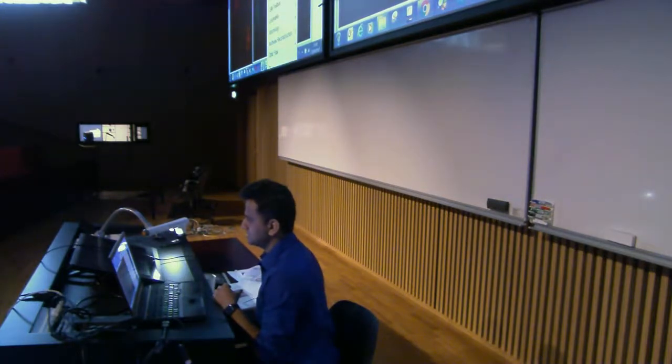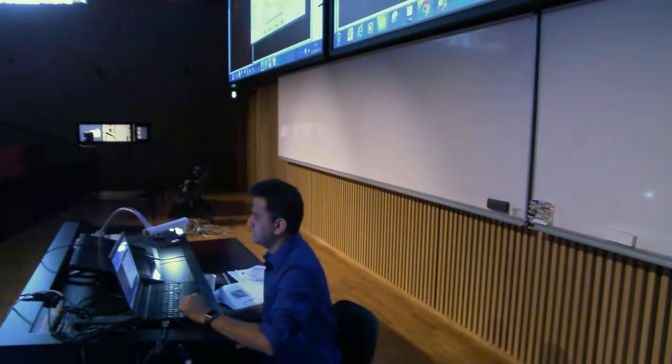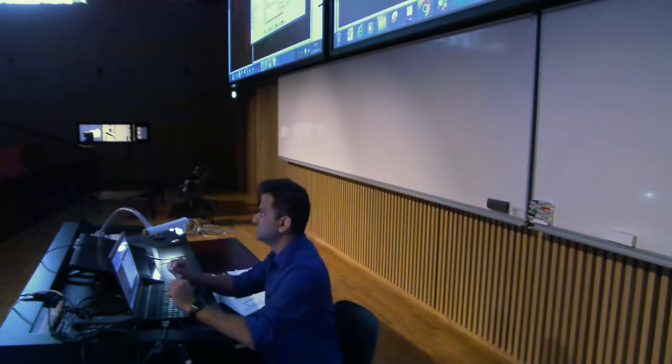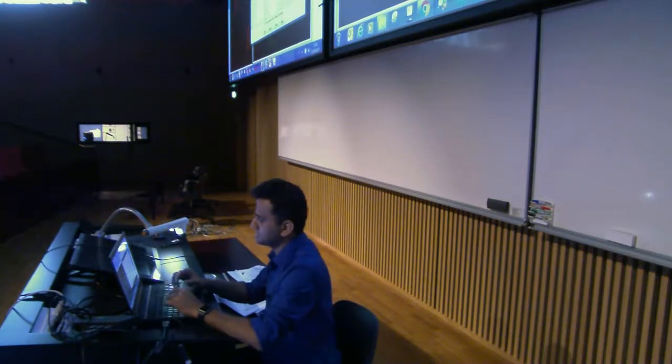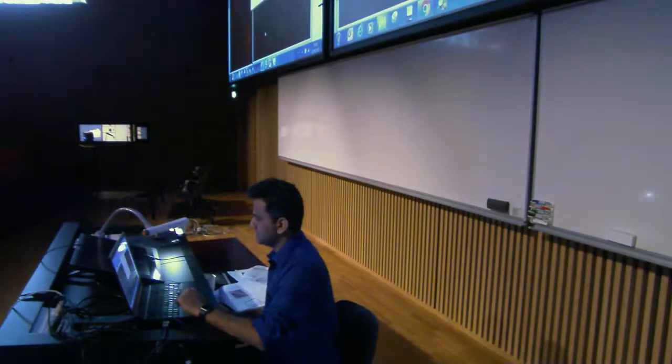Go to plugins. There are so many things in ImageJ, and you might get confused about where is what. In that case, press Control L and you can search your keyword. Let's say co-localization, and it gives me its location, and it is possible to just double-click and run this particular command. So Coloc 2, or let's go for Co-localization Threshold. Let's go for this one, run.